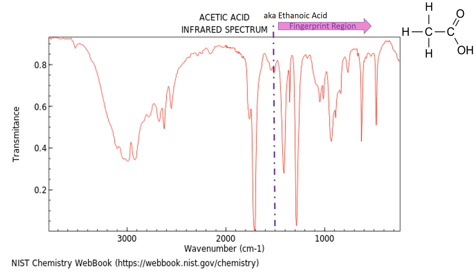So let's look for that C=O bond first. The C=O bond is really distinctive in infrared spectrums, and it appears in a really narrow window between 1680 and 1750. I put the little arrows there to show you that really narrow window they appear in. So if you see a peak like this, you go, right, I know there's a C=O bond.